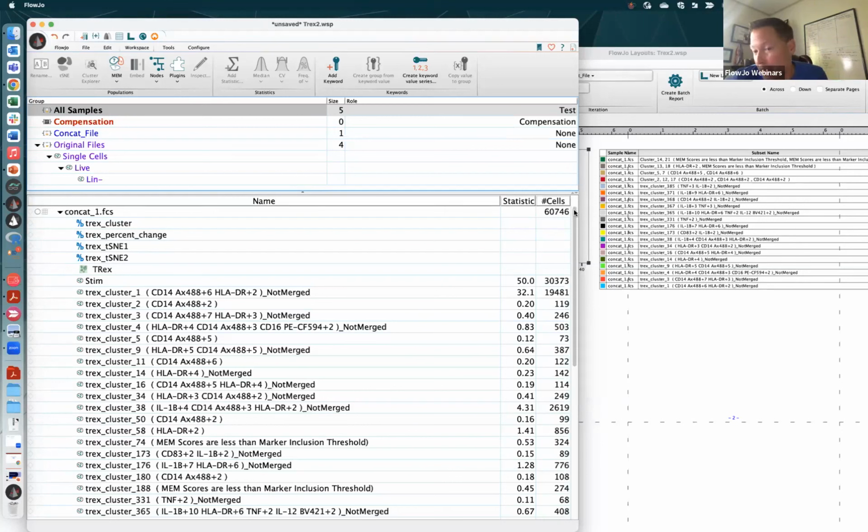If your reference is unstained cells, that could just mean it's super bright. If your reference is already very bright cells, you might max out at a MEM plus 5, compared to something that was MEM plus 1 that would only be a little bit brighter than the reference. If you choose the reference as MEM, then it's a much more direct scale, like just moving across your intensity scale of less bright to bright. Okay.